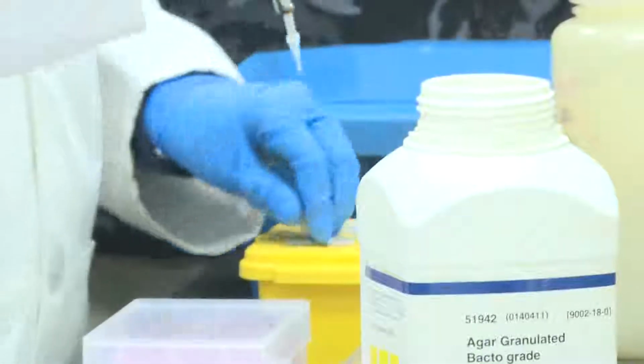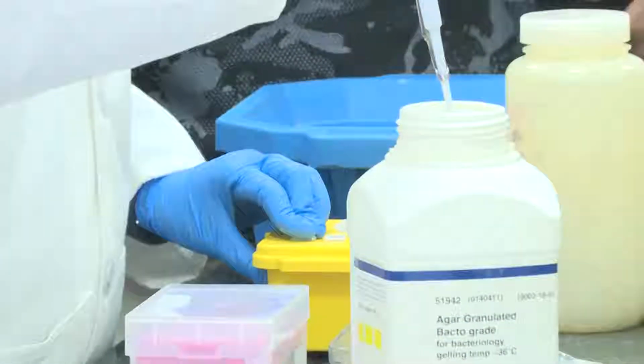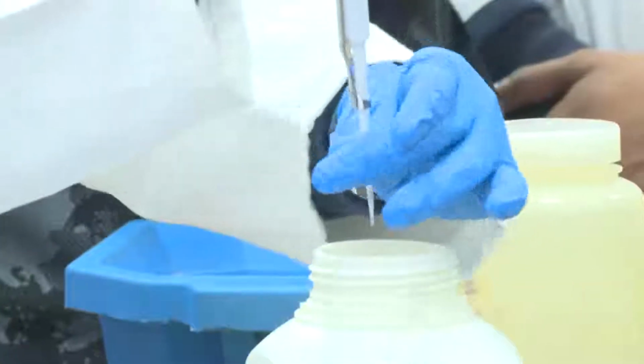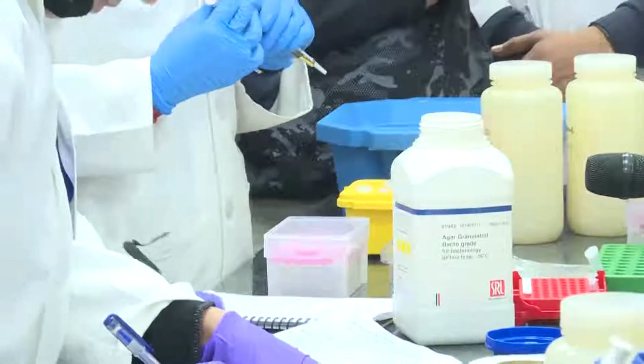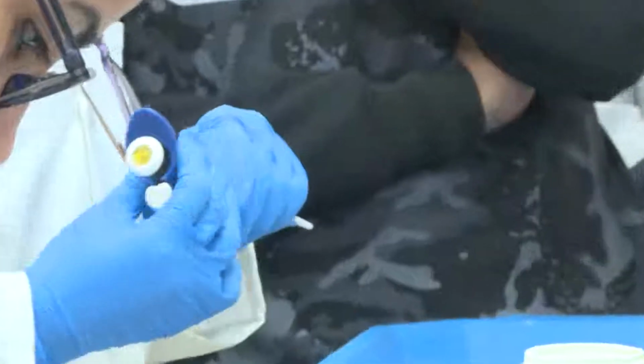She has already prepared the master mix with the primers, but without template. Template will be given to each one of you, and you will have to add the template. Template is about 6 microliter? 4 microliter. 4 microliter.